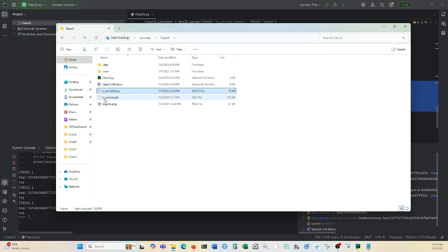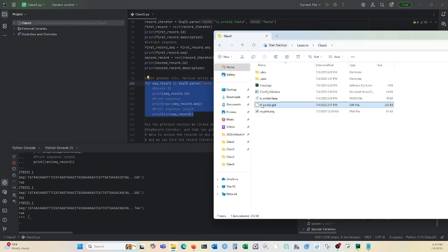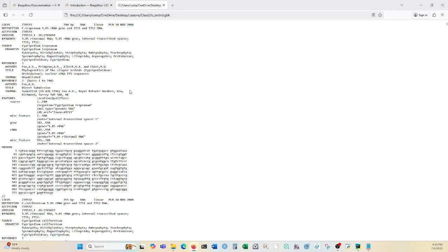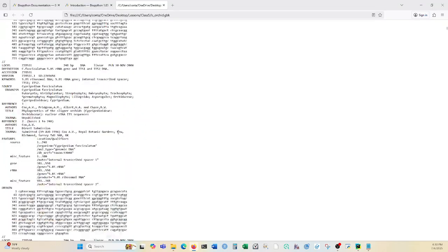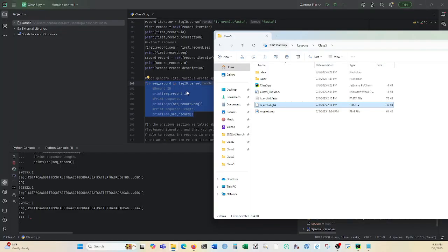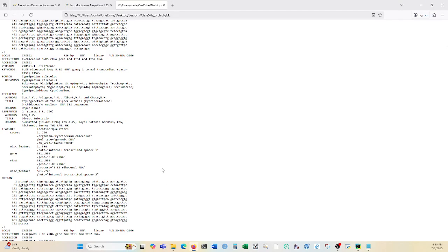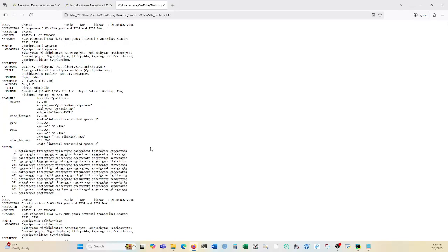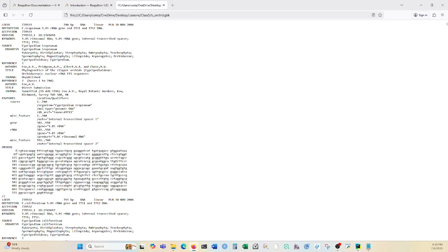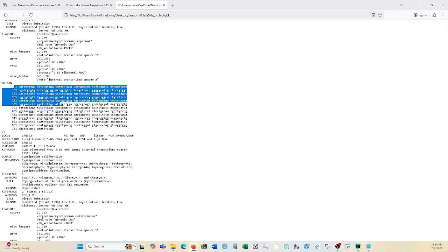I should show you the GenBank file. Give me a second. Let me try to open it in this. You can see here is the GenBank file, and the FASTA is pretty clean, but looking at this, it's very useful to use Python to organize this, so you don't have to do this manually, copying this and separating the numbers from the text and what is what.